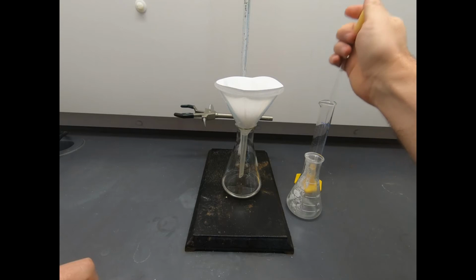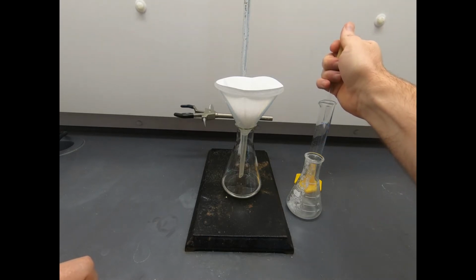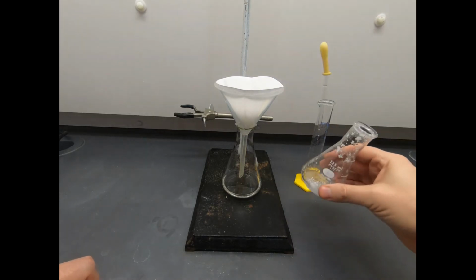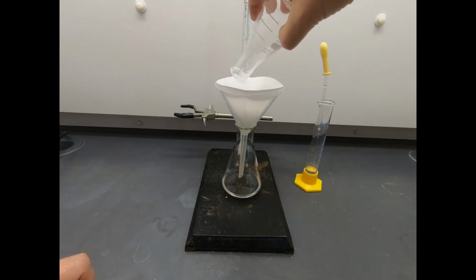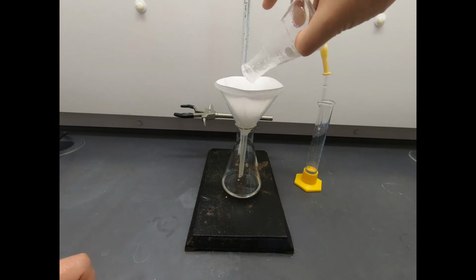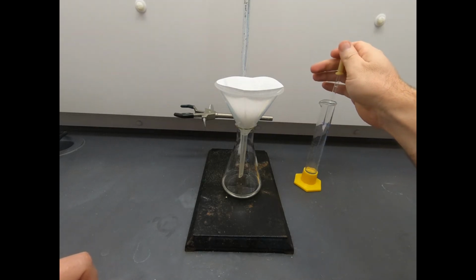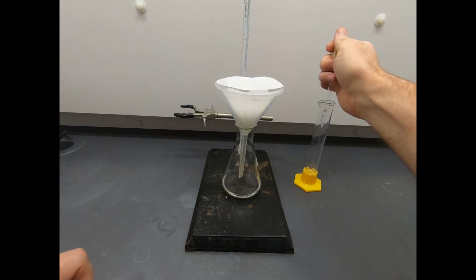And what that means is we might actually not get a 100% rinse here because we don't want to add too much isopropanol. I've got about 10 or 15 milliliters here. So the thing is, we know our product is soluble in isopropanol. So the more isopropanol we use here, perhaps the less precipitation we'll get when we add water. Now we could just try to add more and more water, but then you're just starting to make a mess. You're just using tons of solvents as a guessing game. So let's try to minimize our use of isopropanol right here.